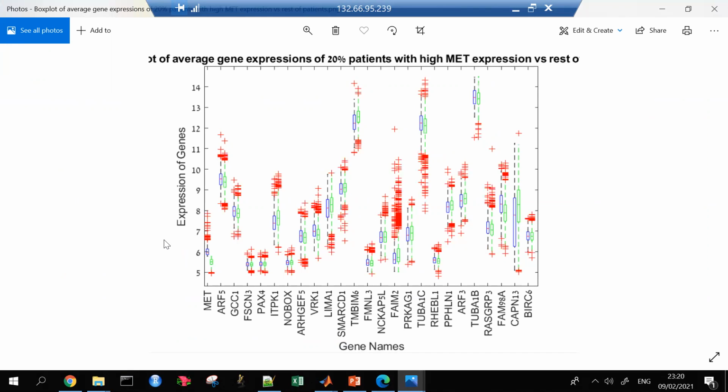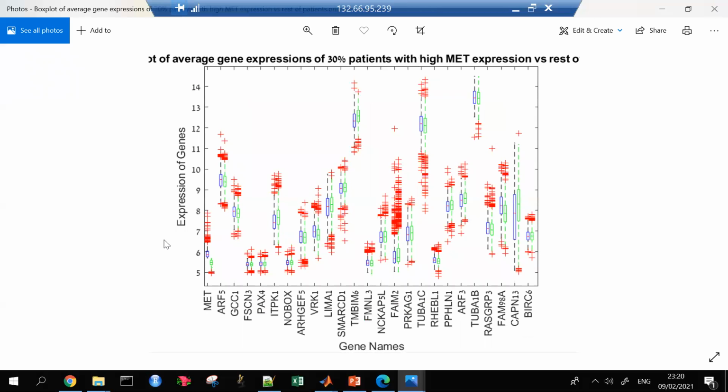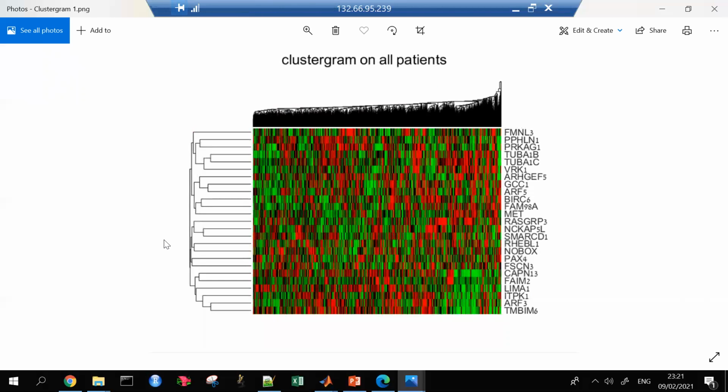And as I said before, I also took graphs with only the significant genes, because sometimes people give me more than 400 genes and the plot is just too cumbersome. So you can simply reduce your plot to only the significant genes.